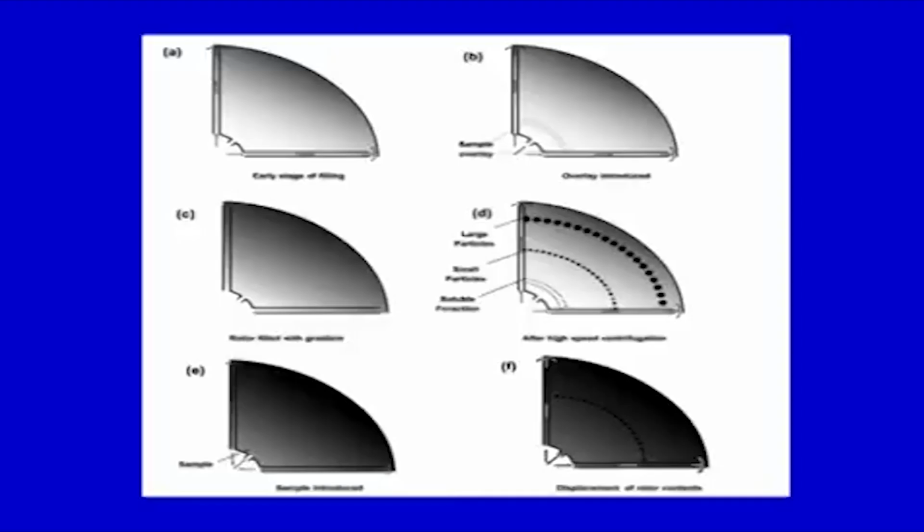To understand the whole thing which we have discussed, if you see here, the hollow bowl or cylindrical form of the rotor, like I said, is separated into 4 compartments. This is one of the compartments, and this is the central area here. There is an opening here, and from the top central area the sample can go from this side. As you push the gradient material, it will be overlaid in here, and in all 4 compartments it will lead, and then finally you have got the gradient.